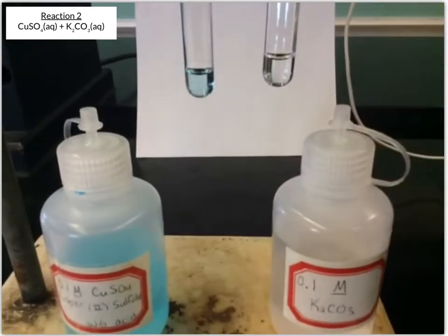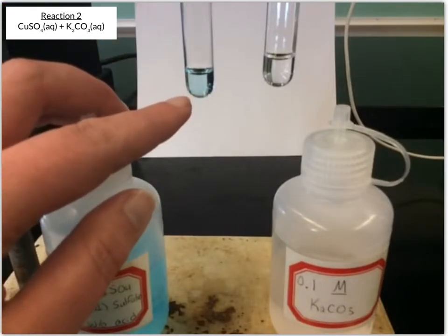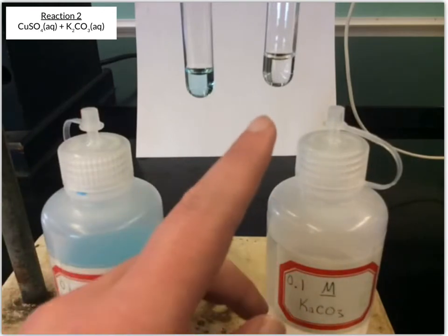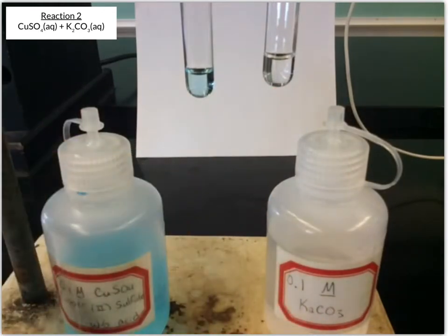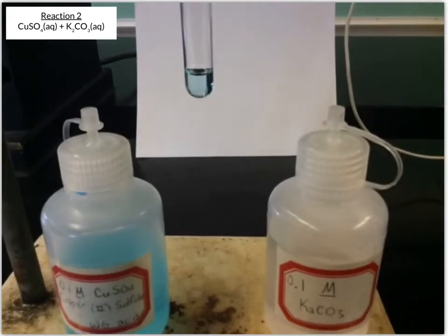Okay, so we have our copper 2 sulfate, and you can see that's a clear blue solution. And then we have our potassium carbonate, and that is a clear colorless solution. And so I'm going to take the potassium carbonate, and I'm going to pour that into the copper 2 sulfate solution.